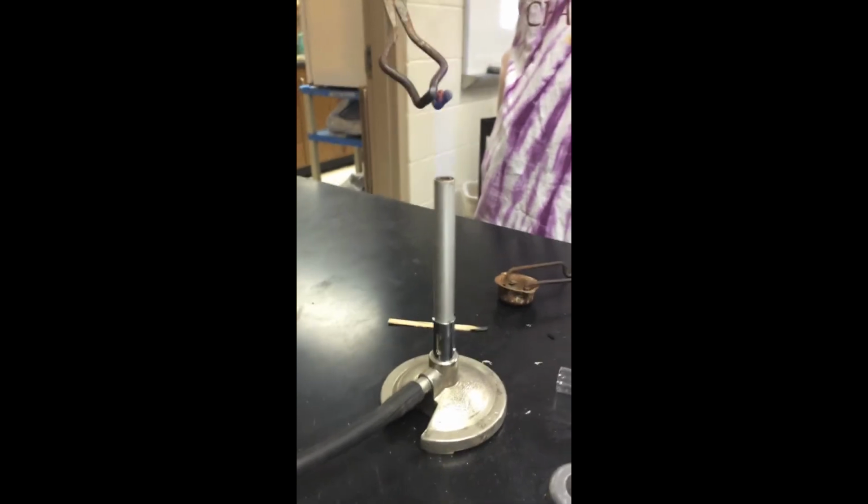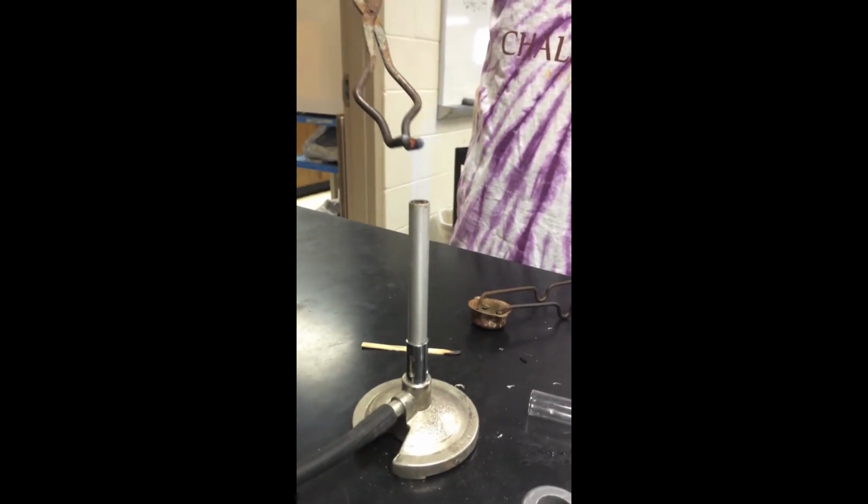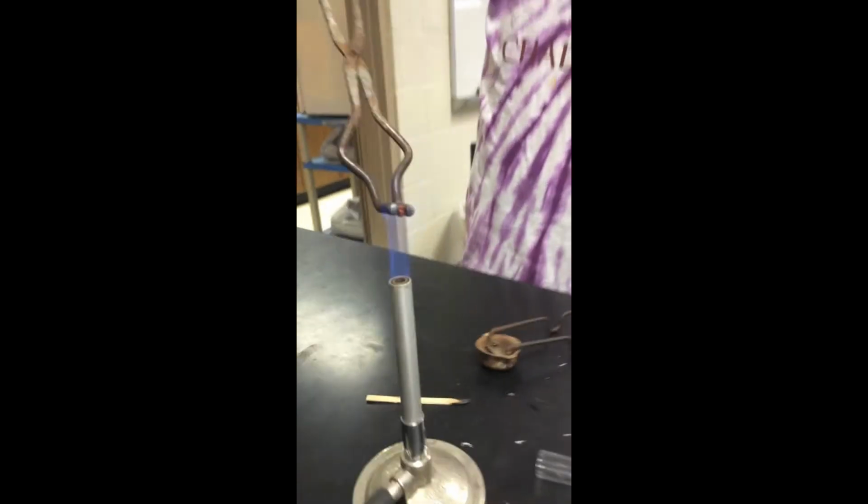We got a 2 centimeter piece of copper sheet metal. We held it with crucible tongs over the Bunsen burner for 2 minutes until the change is observed.